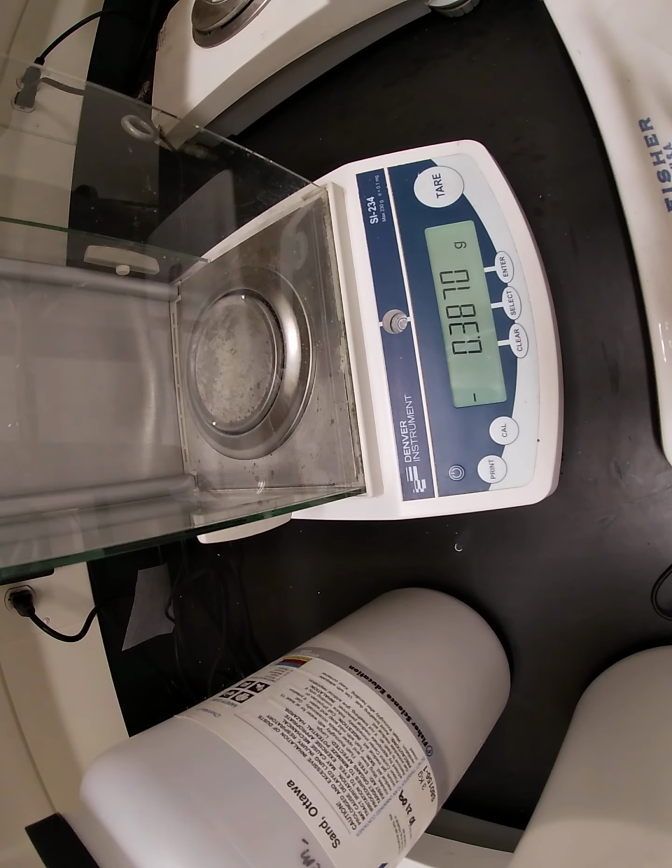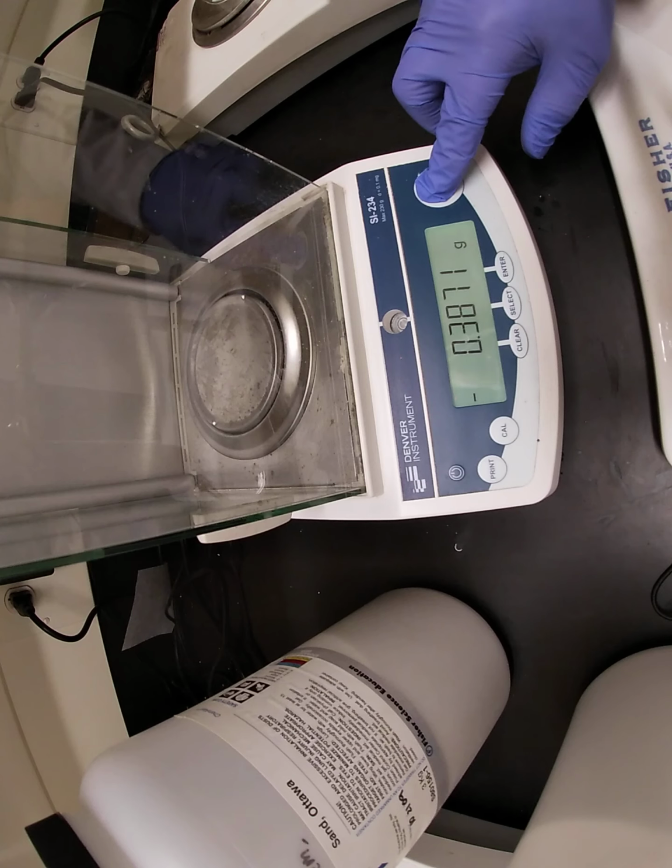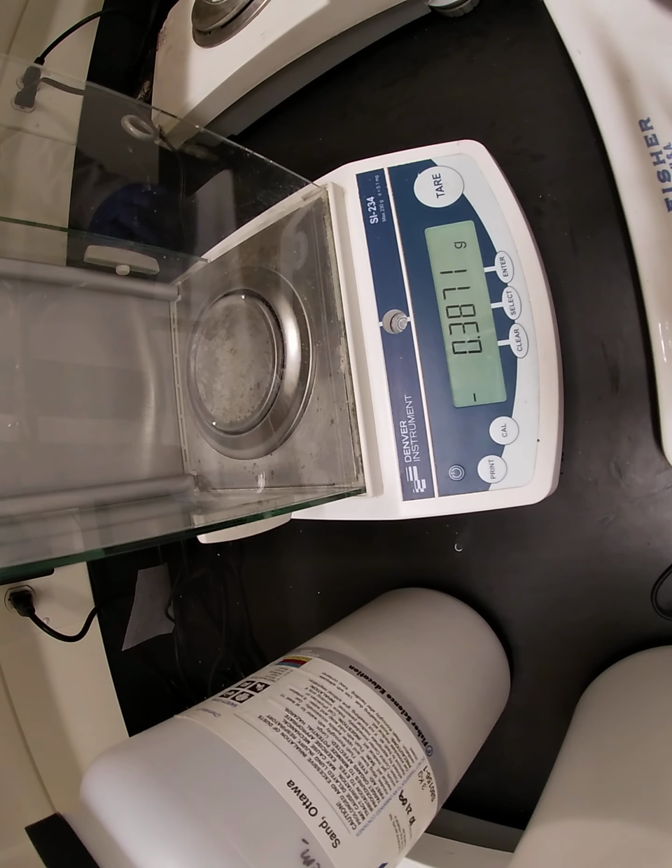Now the trick is to get this out of there without spilling it, and we're going to put it into our beaker over here on the side. So that is sample number 1. That was naphthalene. This is more commonly called mothballs, and if you were here to smell it, you would probably recognize the odor.